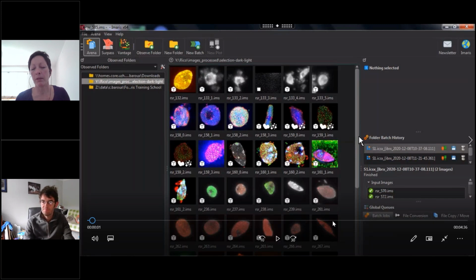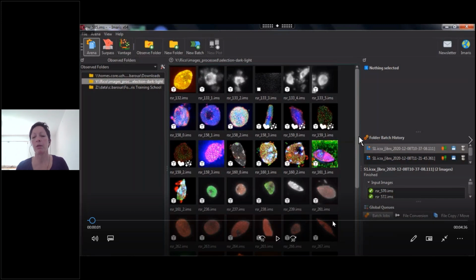Yeah, so what I call body-centric organization is if we consider a nuclear body to organize the signal of your protein of interest. It could be that your protein of interest is gradually decreasing in intensity away from this body, or on the opposite, it is strongly associated with this body. So body-centric means the nuclear body that you're looking at. It can be chromocenters, for example. Around these chromocenters you could have certain proteins that accumulate at high density, and the further away you move from the chromocenters, the less of this protein you have. That would be what I call body-centric.